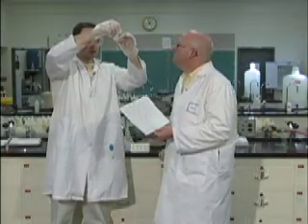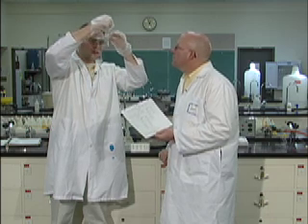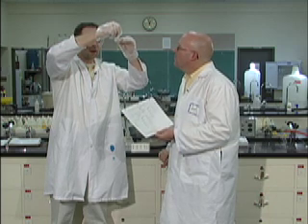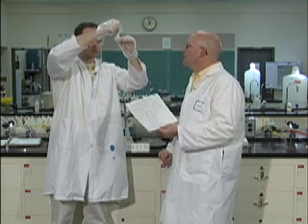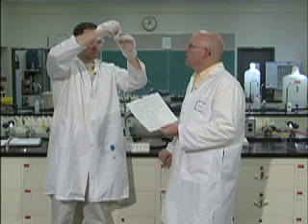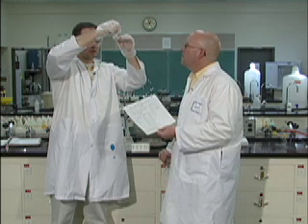And you can see it. It's like a clear jelly-like solid. Yeah. And there's also some yellow and orange solid in here. So basically what we know has happened now is that we have a solid formed. That's different than a precipitate like the last one. You could tell the other one was a precipitate, sort of a white solid. This one is a different kind of precipitate. Yeah, this is a jelly-like precipitate.